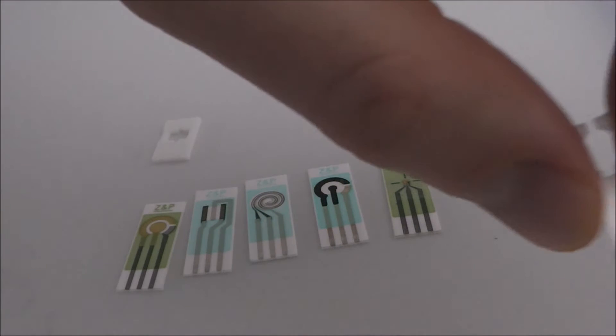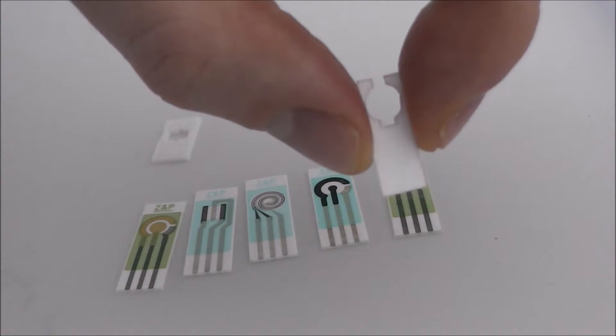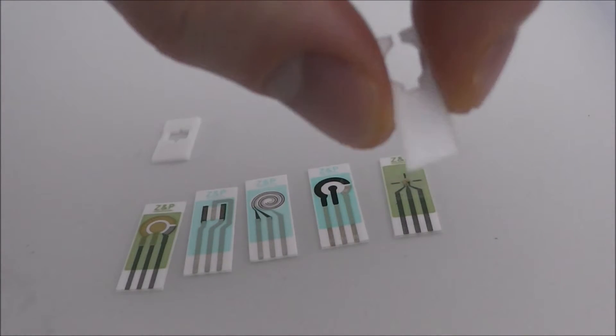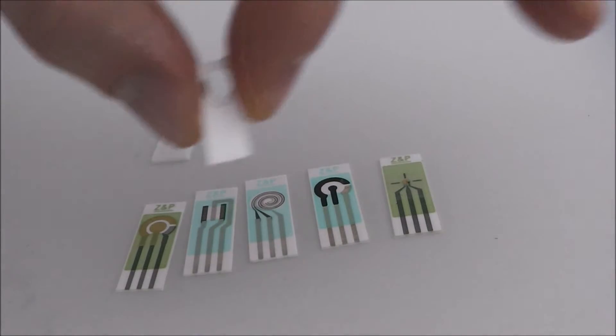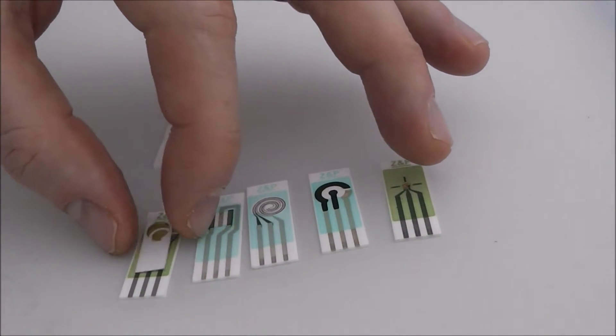The second step is to take something like a spacer layer. This is quite a thin, fairly low-cost piece. But what a piece like this would allow you to do is it would allow you to place it onto one of the sensors and start defining where solutions actually went.